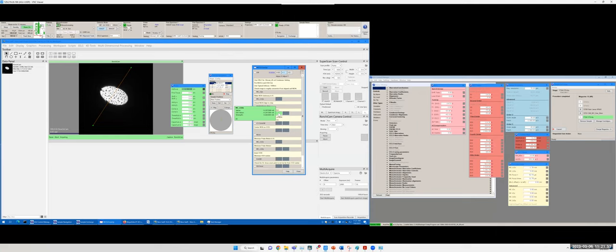When we do this alignment, we are actually looking at the image in the background, looking at how those gold particles are moving. If you don't have gold particles, you're looking at how the amorphous carbon is moving. That's something you look for. But normally we can also tune it to make sure this monochromator aperture is going through the VOA aperture. We can do it both ways.